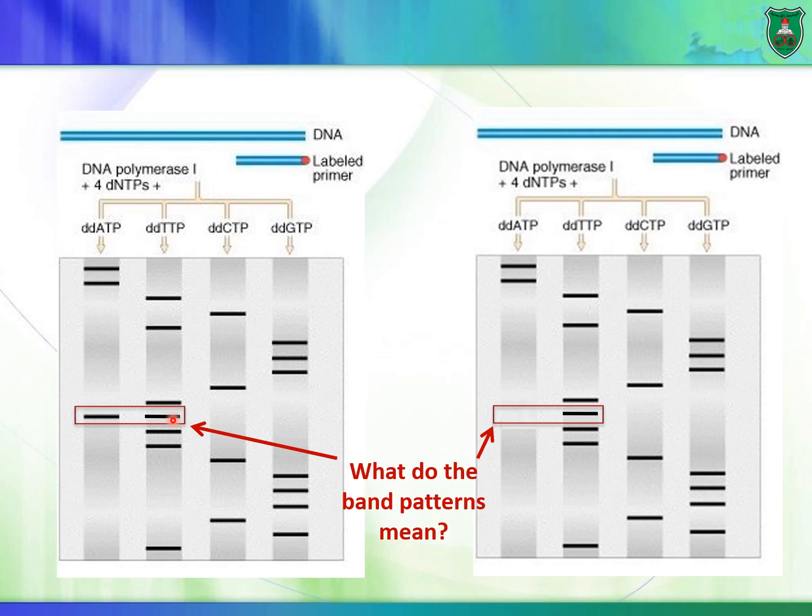So let's say that the DNA polymerase is reading both DNA from that individual, okay? So it reads this DNA A, the other DNA A, T, T, G, G, C, C, etc. But then there is a variation in one nucleotide. In the mother's DNA, it's a T, and the father's DNA, it is an A. So the DNA polymerase would read both. And remember, we have again a large quantity of DNA molecules from the mother, from the father as well, or from any individual.